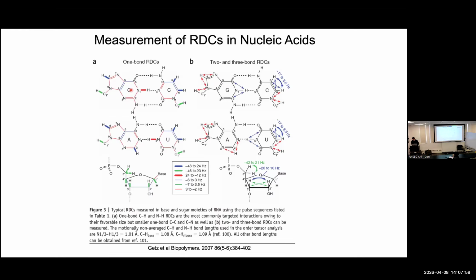And you get a factor of 4 from the gamma. 4 times 3 is 12-fold smaller. And what are you getting in return? Well, the carbon is still suffering dipole relaxation because it has a proton. Now, if you pick carbons that are not protonated, you might recover better relaxation because you don't have a proton. That's CH. So for a typical CH bond, what's the dominant mechanism of relaxation?